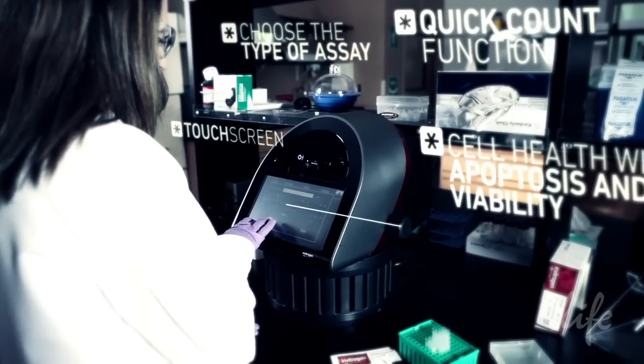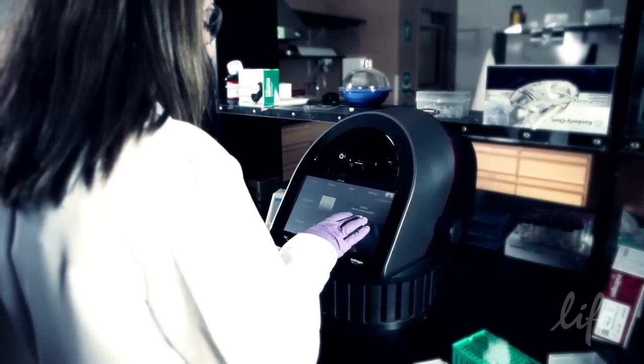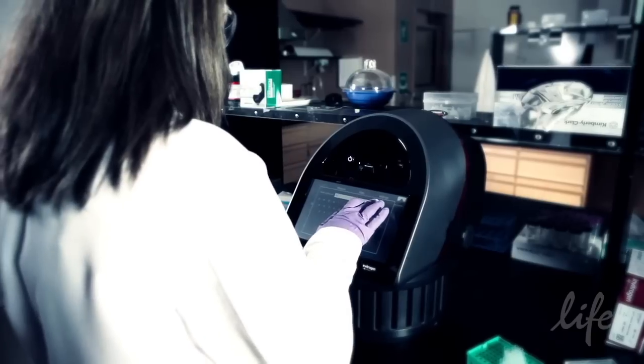There is also an option to create a custom green or red assay. A compatible dye chart can be found at lifetech.com/TALI.